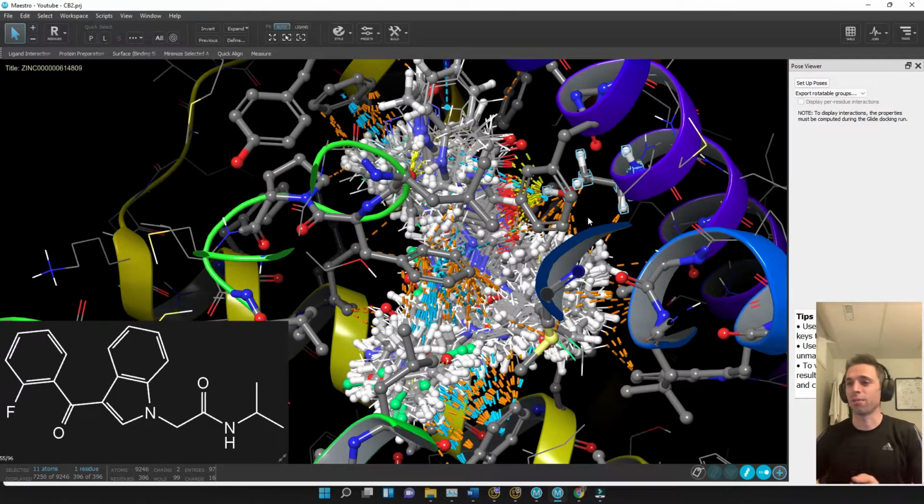I'm sure there's a way in Maestro. This is a very extensive program. I don't know how to use all the tools in here. So back to what we were talking about.